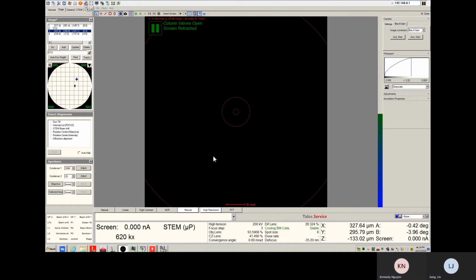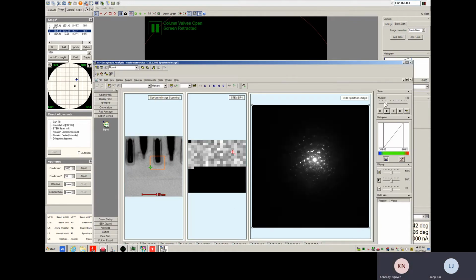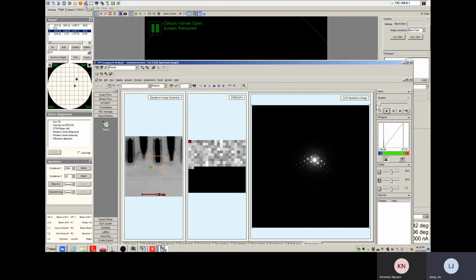Yeah, if you mean here, right? You don't have information within the F4, right? Oh, okay, I know what you're saying. Yeah, it's possible.